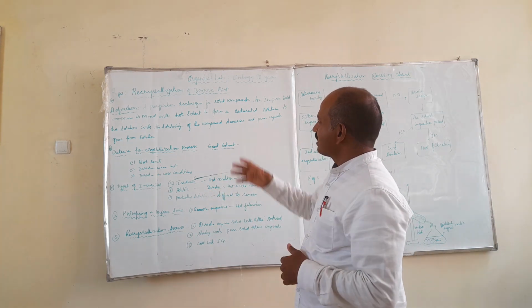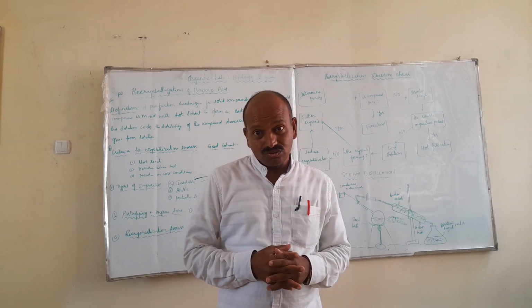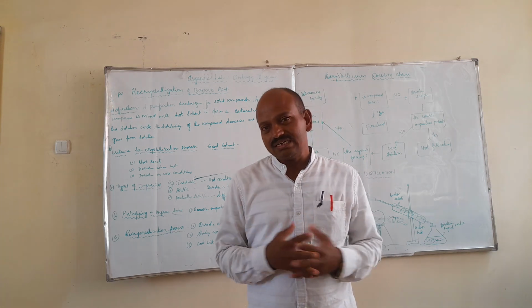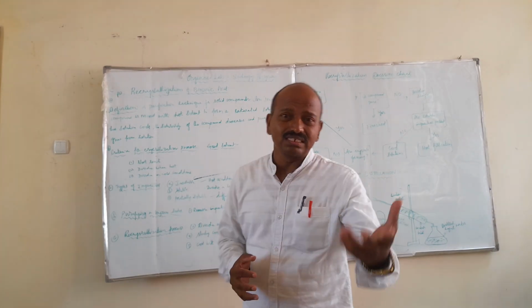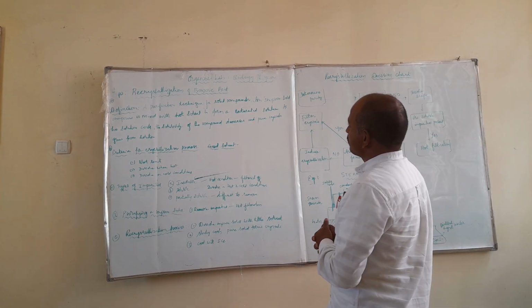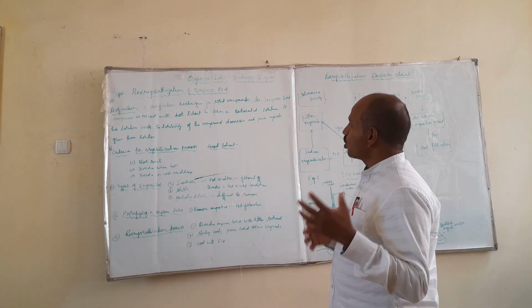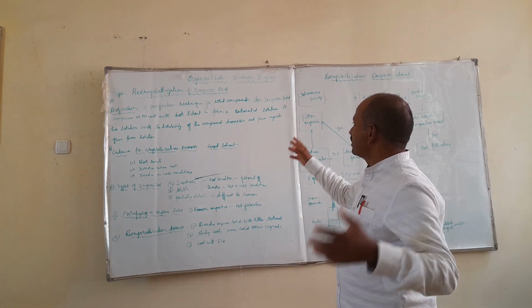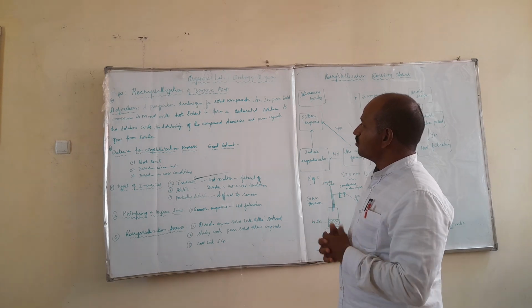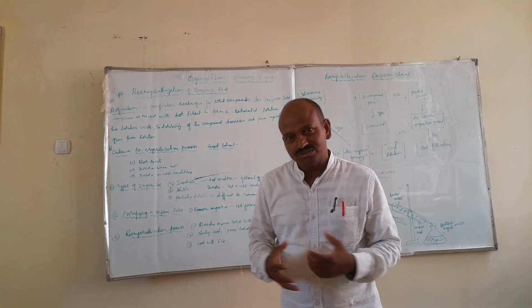In the recrystallization of benzoic acid, there are some solvents that are used for the process. But before that, let us understand the definition of recrystallization. It is a purification technique for solid compounds. An impure solid compound is mixed with hot solvent to form a saturated solution. As this solution cools, the solubility of the compound decreases and pure crystals grow from the solution.